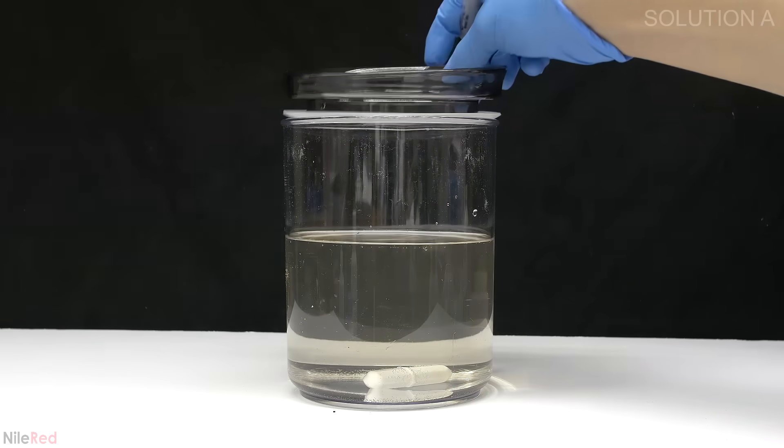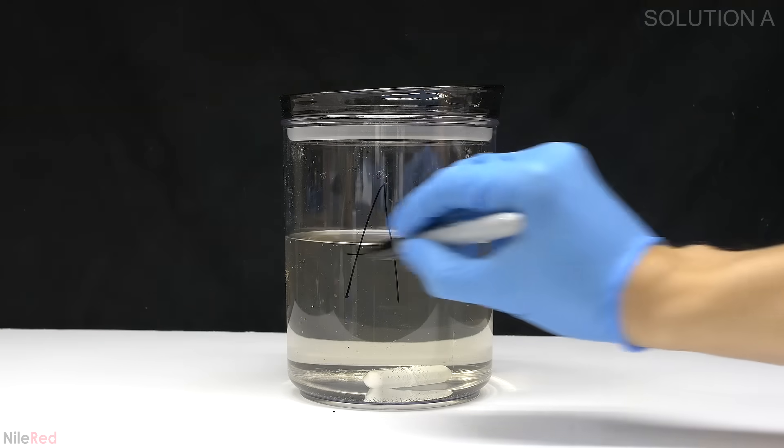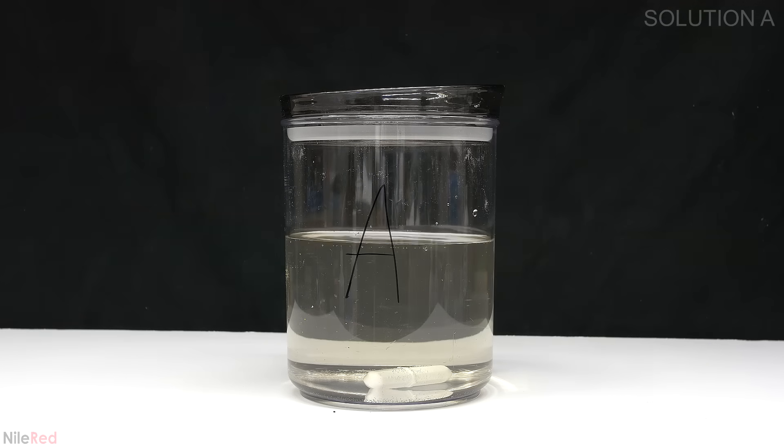At this point I'm done making the first solution so I mark the lid and the container with a letter A. This is placed on the side and I move on to making solution B.